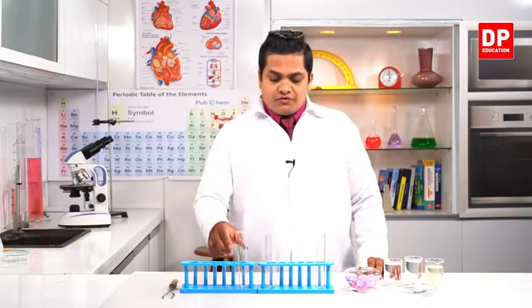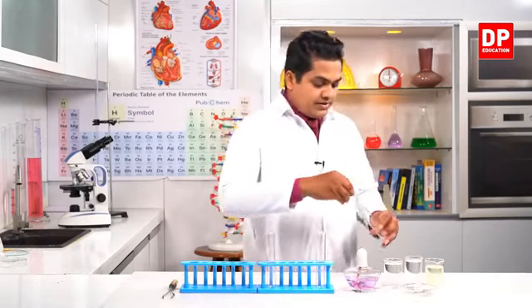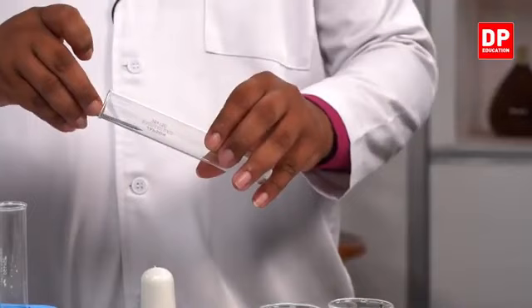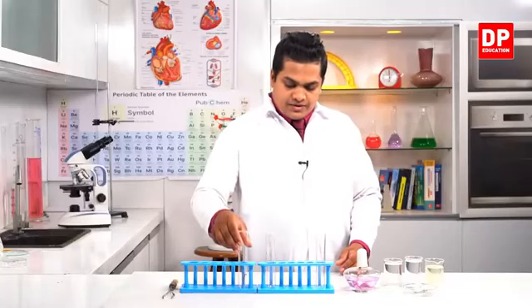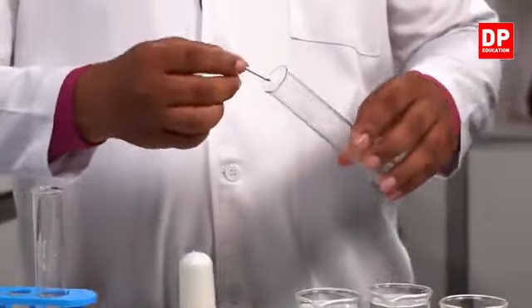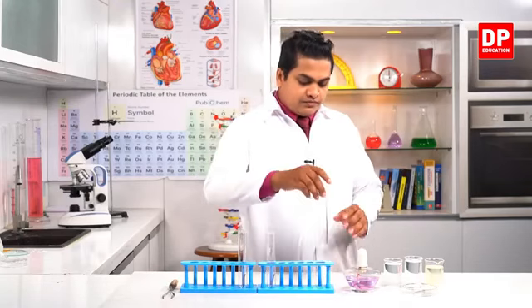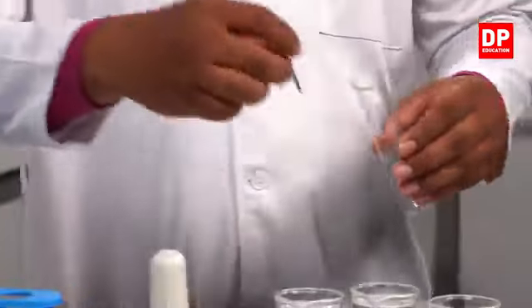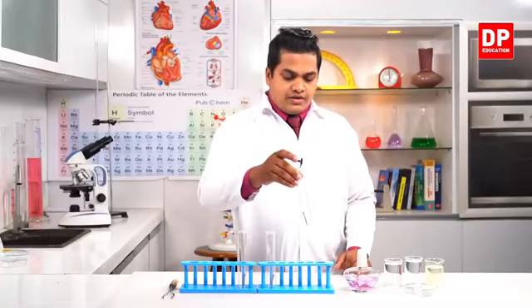First of all, I'm going to insert 1 iron nail each like this into the 3 test tubes separately. Number 3, right?